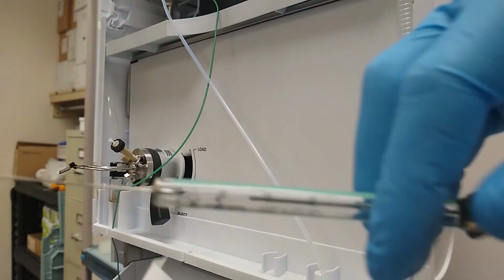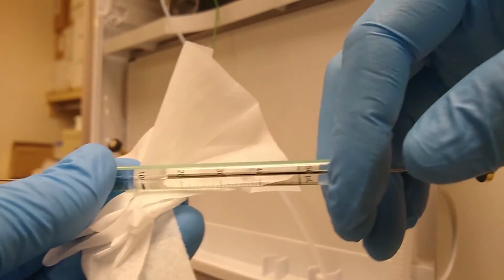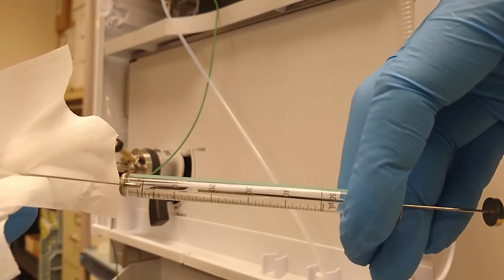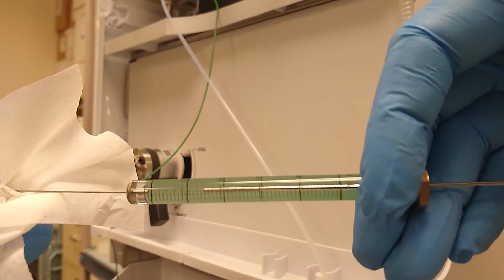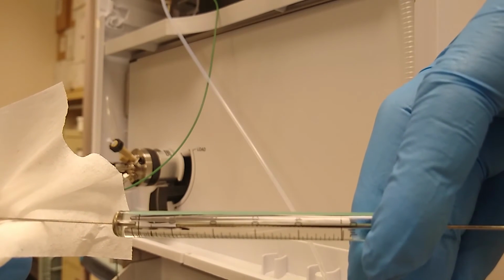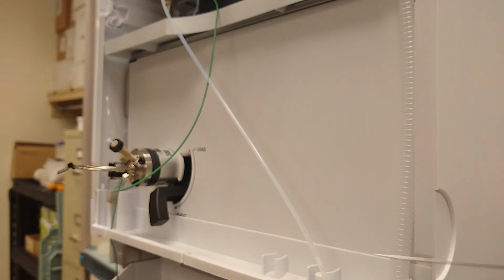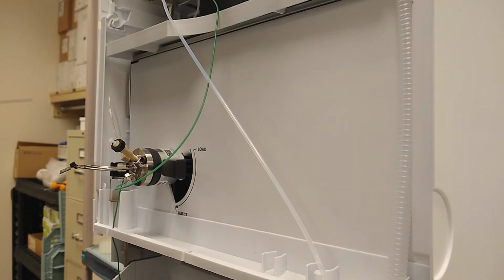So this first sequence here is preparing an injection. So as you can see, these marks on the side of the needle are in microliters. So I've drawn up the caffeine sample a little bit past 10 microliters in order to make sure there's no air bubbles in the syringe. And now I'm going to slowly press out the excess sample until I get down to as close as I can to 10 microliters. So you got to think, like, if I'm off by just 1 microliter, then that's 10% error from injection to injection. So I need to be really careful to get that correct. Now I want to move this lever to the load position.